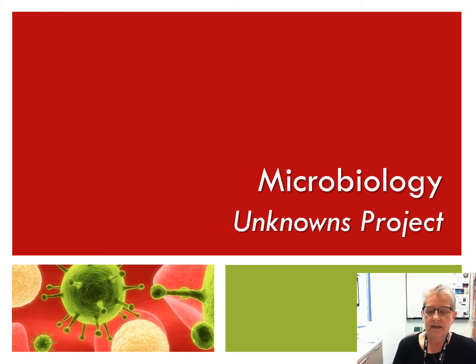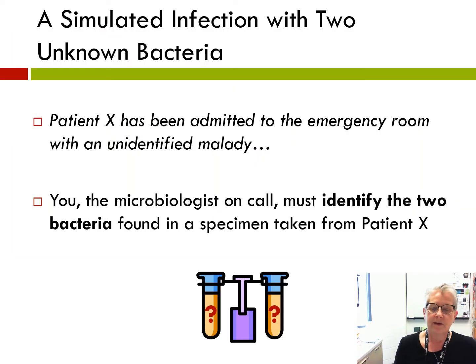On April 19, you will begin the unknown project in this course. You will be given 2 bacteria that you will need to identify. So how will you, the microbiologist, go about identifying the 2 bacteria so that the physicians can make a treatment plan?